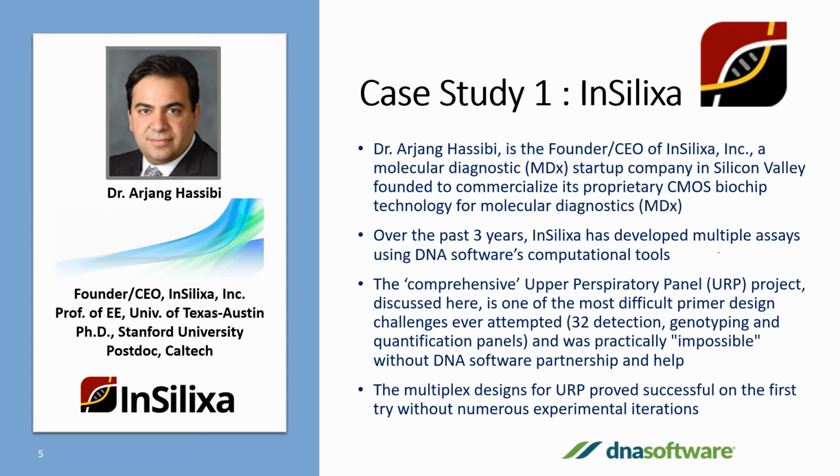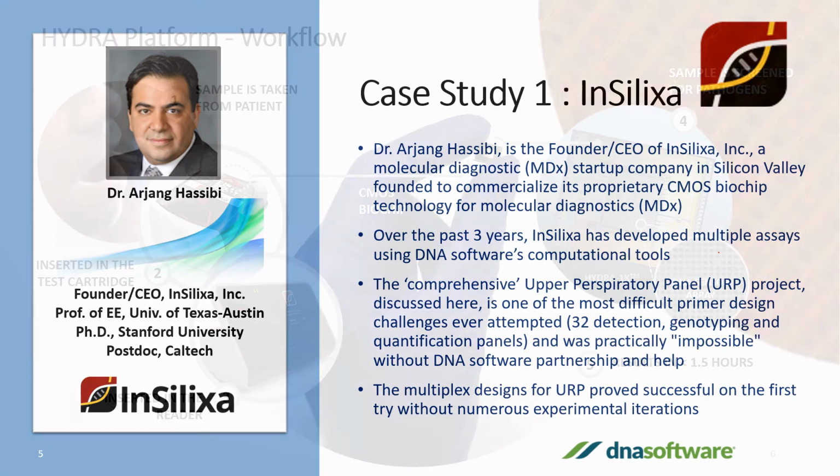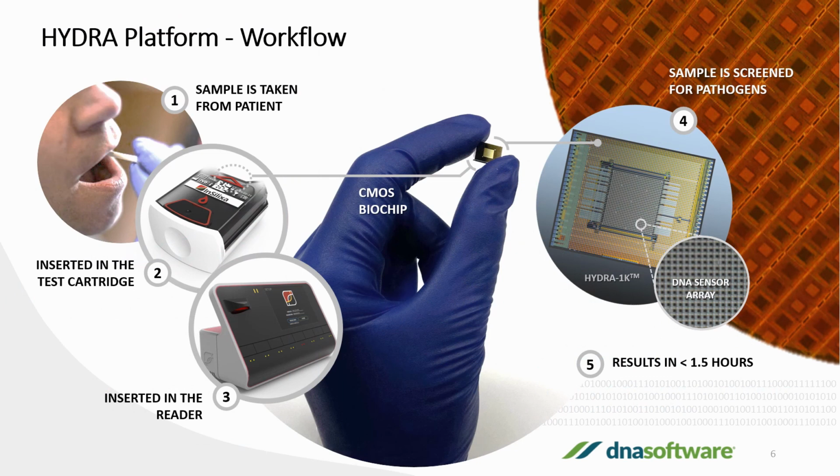Specifically, with the tools that are relevant to the PCR primer design, like PanelPlex and etc. We have been using DNA software tools for design of many different panels. However, in this presentation, I will focus on showing you the results from a relatively large panel that had detection, genotyping, and also quantification for respiratory infections. First, let's discuss quickly what we're trying to build at InSilixa and why is it relevant to the tools that DNA Software has been developing.